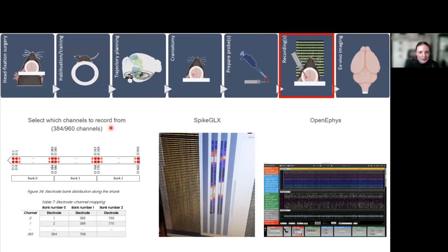I will skip this because I'm already running late, but it has been discussed—you have to select which channels you want to record from. This is a view of Spike GLX, what it looks like when you record, and this is from Open Ephys.